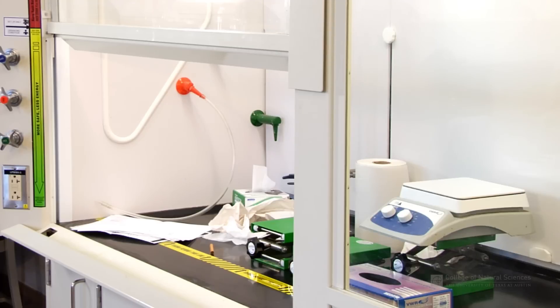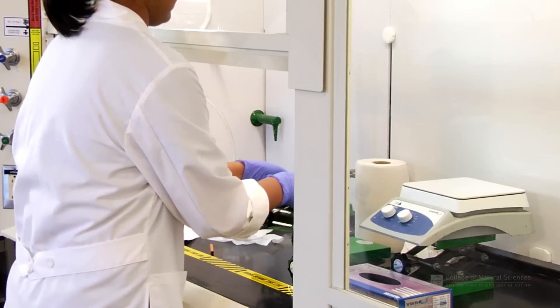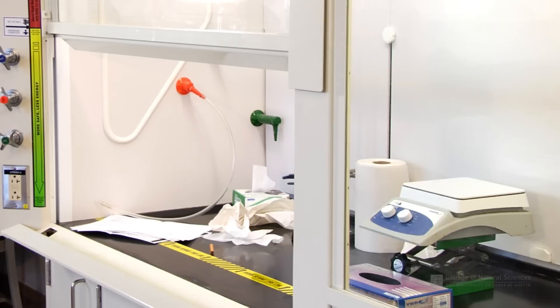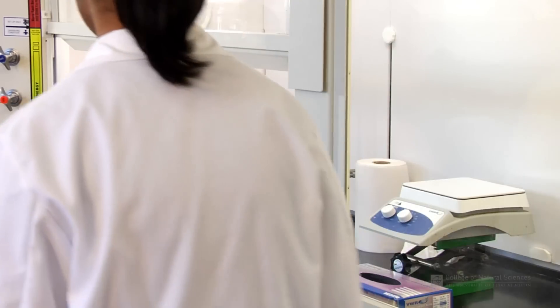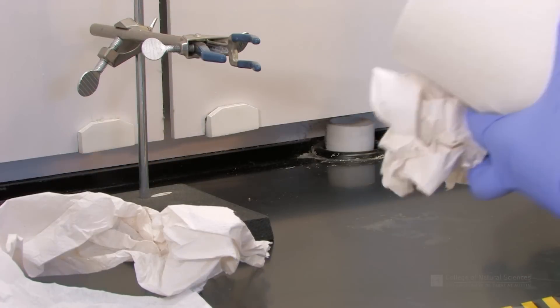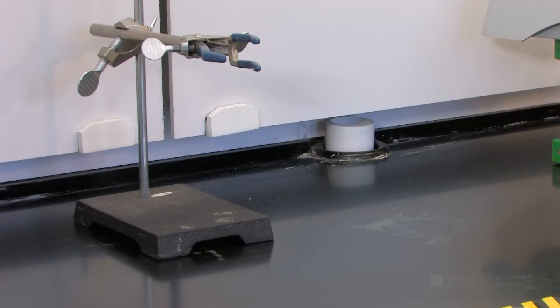Keep the hood clean and avoid storing items in the fume hood. Every item in the hood can create turbulence which can reduce the effectiveness of the hood. Only keep the items necessary for your work in the hood and promptly clean up small spills. As a general rule, paper and other combustible materials should be kept out of the hood to avoid clogging the ventilation system and to minimize potential fire hazards.